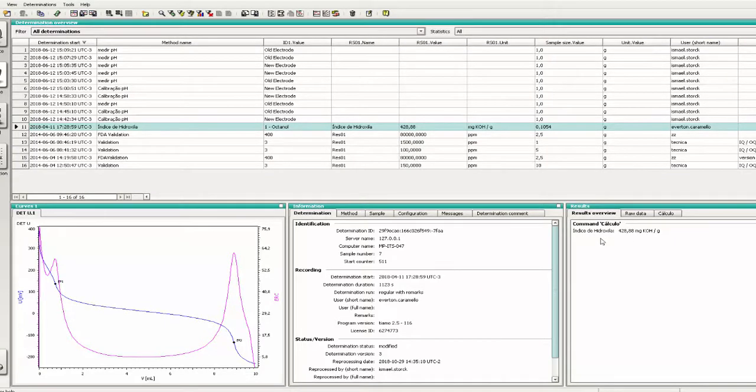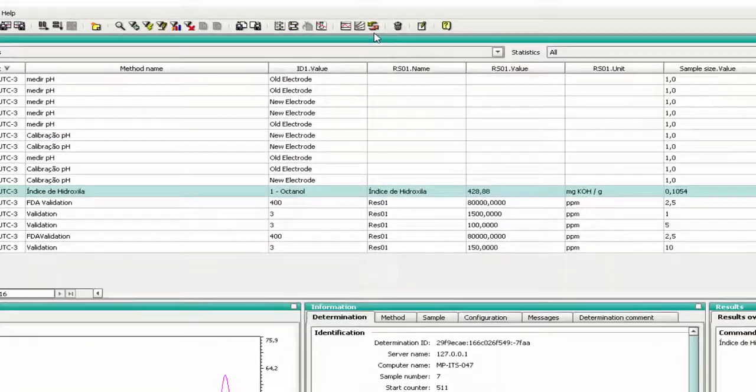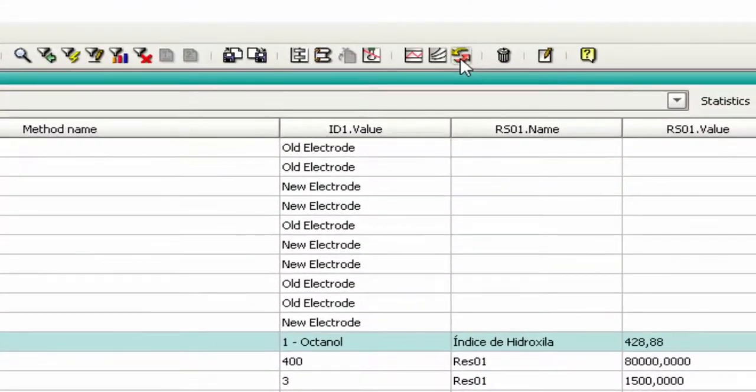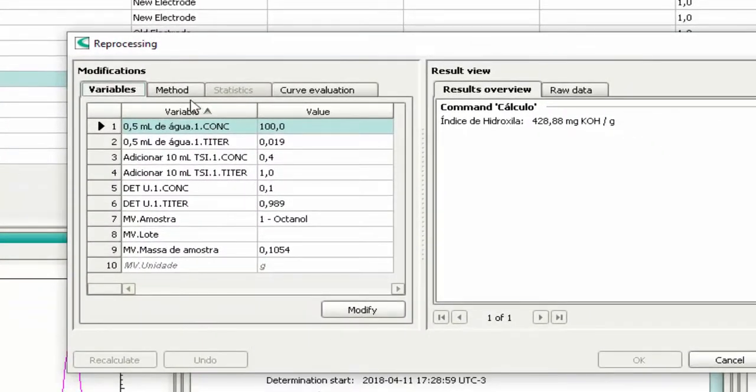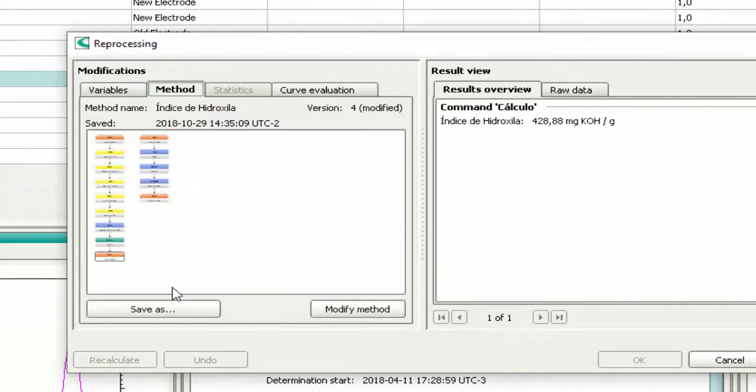If you want to save the modifications in your method or even in a new one, open the Recalculate window, select the Method tab, and press the button Save As.